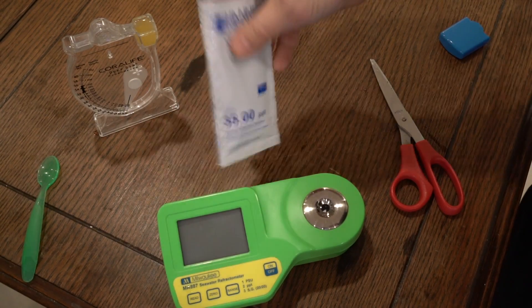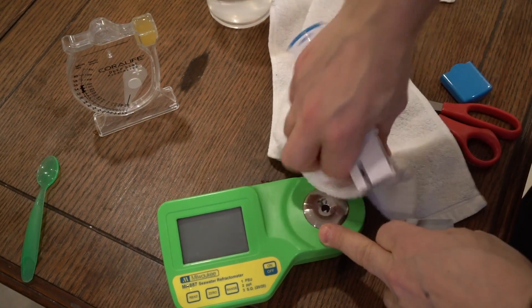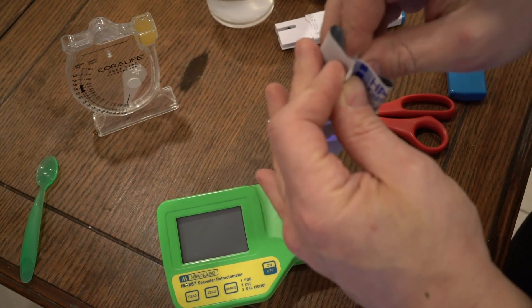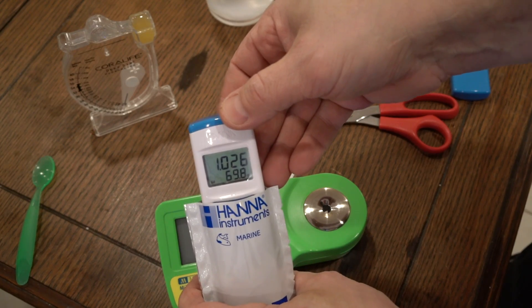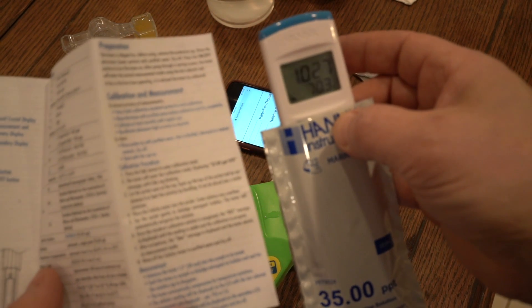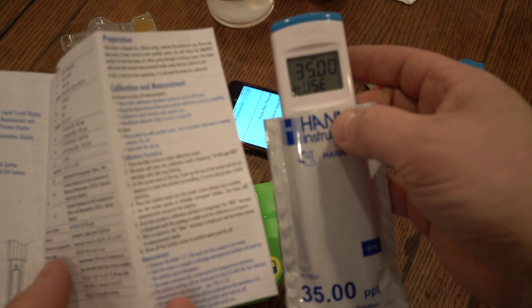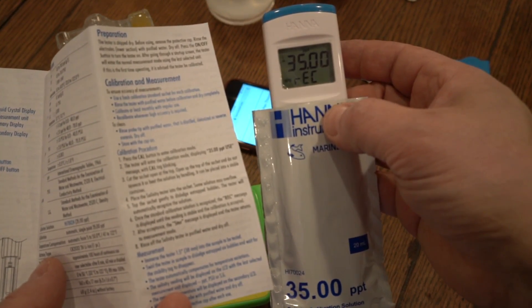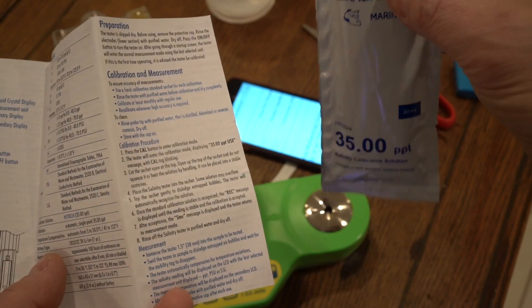So let's pull out the calibration fluid. Let's calibrate the Hanna. I'm also going to try the calibration fluid in the Milwaukee with devastating results — but hey, you've got to try it. Pretty quick. And then to calibrate it, you just hold the calibration button. So you hit the calibration button — it's doing its own thing. The camera keeps going out of focus.